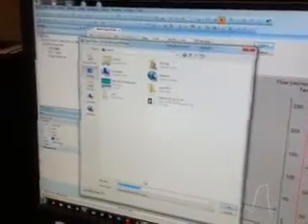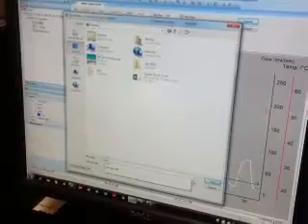So when we push export, it's going to try to save it somewhere. I'll call it test. Alright, so I'm going to put it on the desktop. Oops, what did I do? Oh, did I make a new file in test? Oh, no. Okay, so go back here. Let's just call it 1. There we go. So I saved it on the desktop, and now I can open it, view the file, and it will open it in Excel.